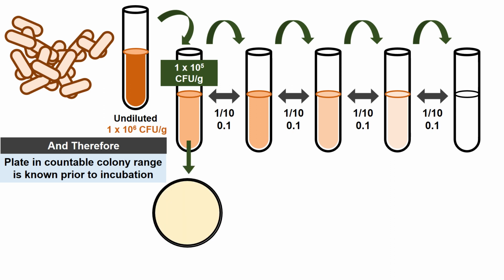Okay, so our goal was then to take 1 milliliter from this tube, spread it onto an agar plate, put it into the incubator, and then come back the next day and see how many cells grew into how many colonies. Do you think this is the plate that has 30 to 300? Let's go through how. We know that actually the answer in this case is it's not. This is still way too concentrated. We really needed to make a lot of dilutions. This is going to end up in a lawn of bacteria, okay? Way too many CFUs.